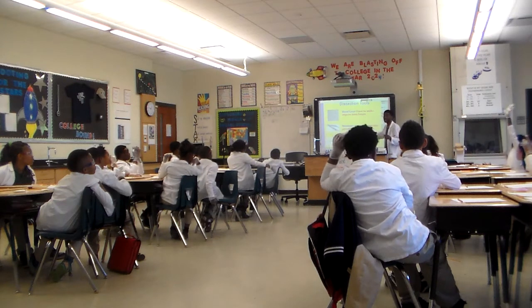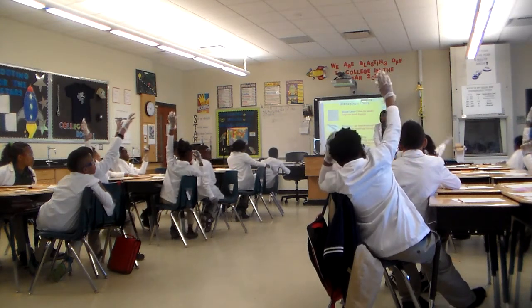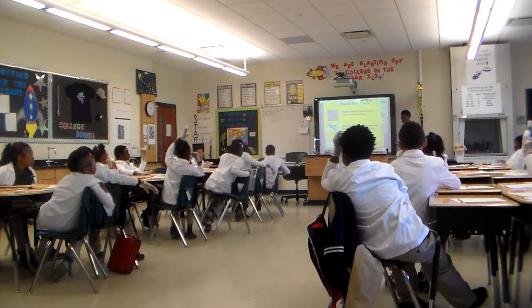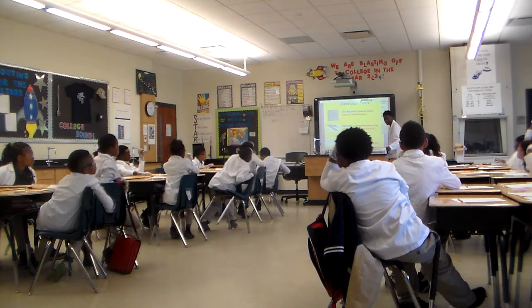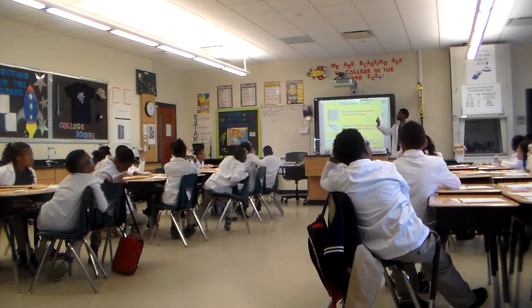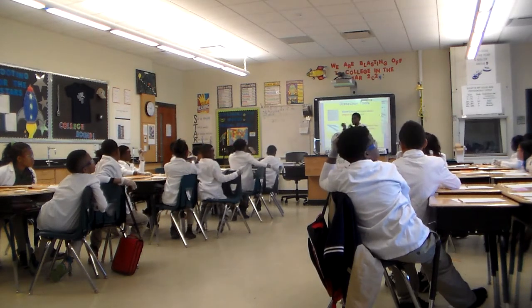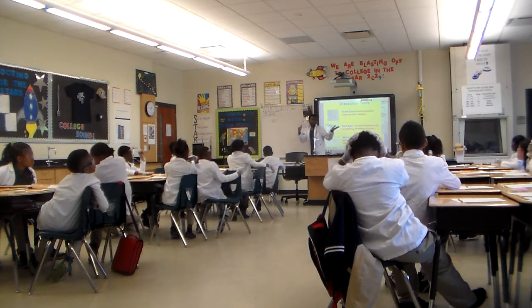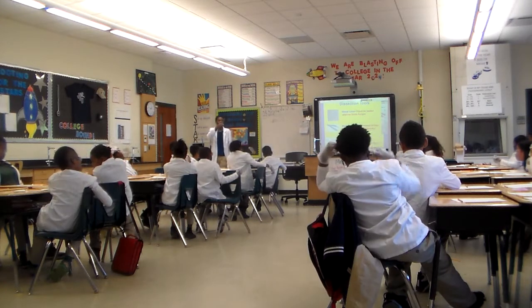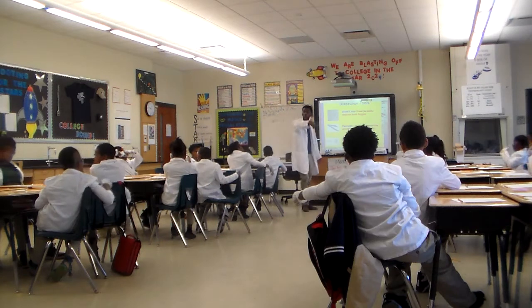Take a look at our last scientific tool of the day. You want to go ahead and read that one for me, Kenneth? Scissors. A cutting instrument having two legs, holes, cutting edges, slide past each other. Yeah, scissors, right? We use scissors pretty often. Well, scientists also use scissors, so keep these scissors handy, because you're going to need these scissors to cut certain parts of the heart, right?